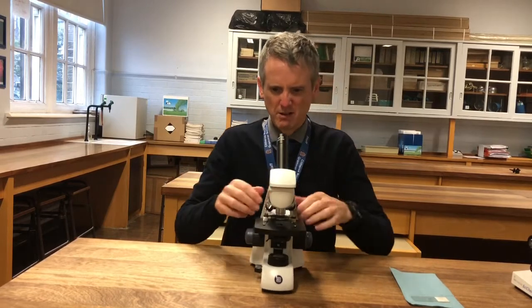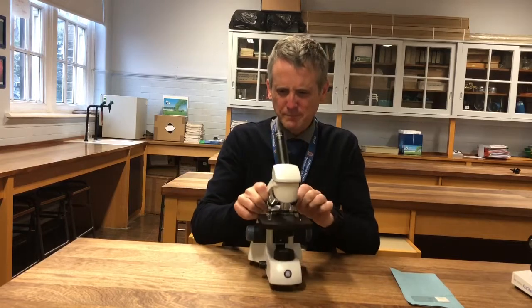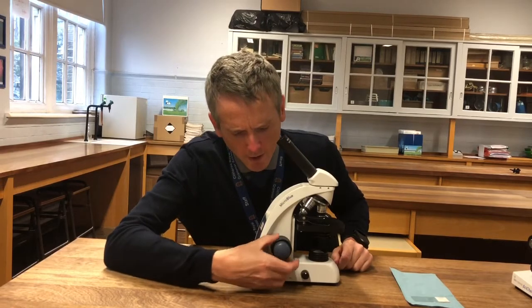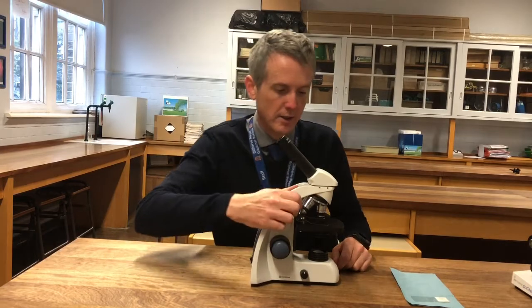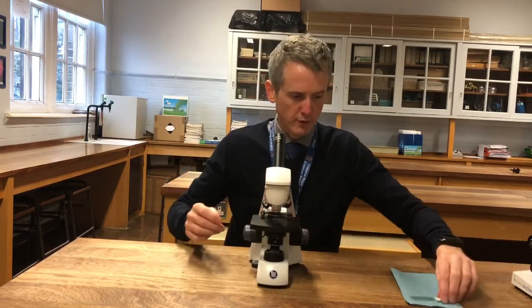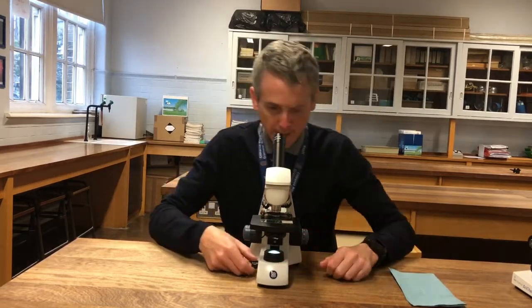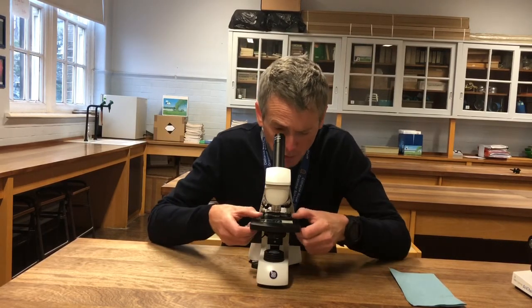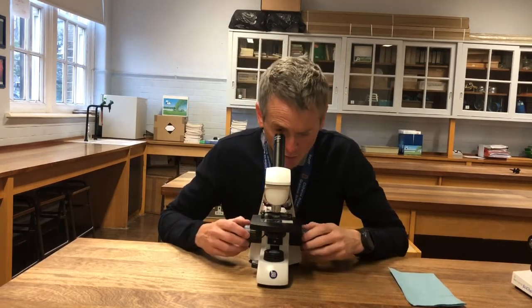This microscope is a newer version, but it's really just the lighter model. The only real difference is that it has a joint — the outer wheel is the coarse focus and the inner wheel is the fine focus. But it's exactly the same process: move those stage clips away, put the specimen on, turn it on. There's a power button on the back. Get it focused before too much light comes in. Manoeuvre the slide into the centre, then change to the next power — that's the yellow one.